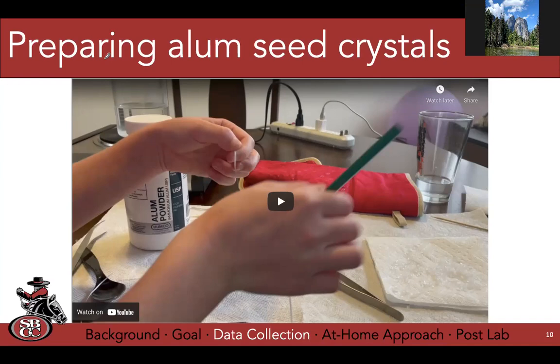Is there any way you recommend adding the water, or just, like, carefully? Yeah, carefully. So I have a couple of hot mitts, and I was holding those. Definitely, this is a great question, and it's one of the reasons. If we have more hot things in our lab, the more risk that we have of having an accident. And it's really important to talk about this because our labs this week are our homes, and all of our homes are different. I've got 2 kids in my home. People have siblings, they have their own kids, they have other roommates. And so there's a lot of moving pieces, and we want to make sure we're staying safe.